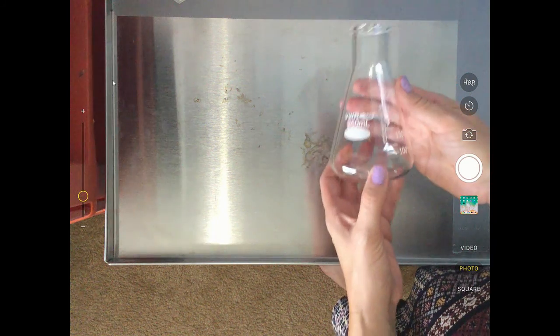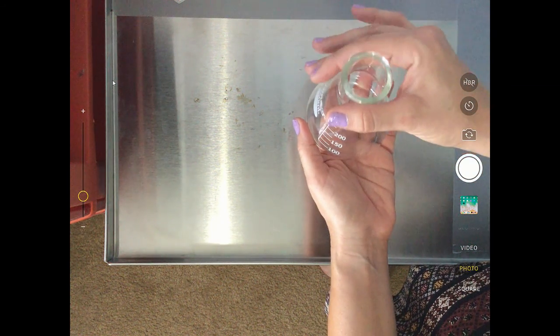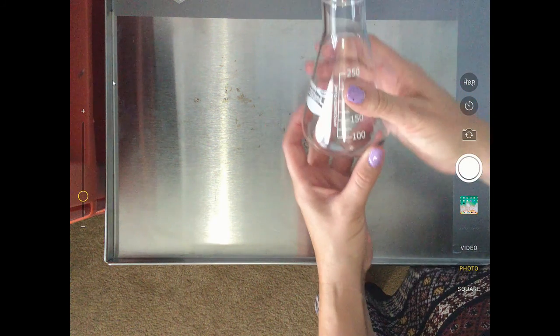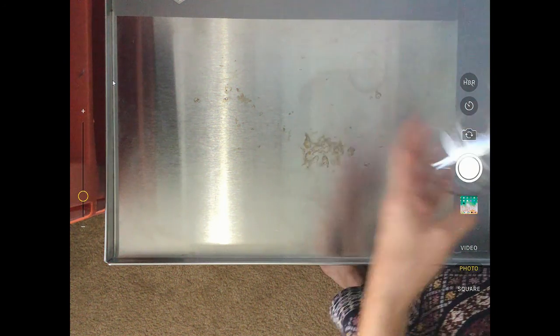A lot of times when you see mad scientist videos about Erlenmeyer flasks, people say, oh, look at what's in that beaker. This is an Erlenmeyer flask. It is shaped differently. It's got more of a triangular base, but it is also three-dimensional. It is also what we use to hold liquids, and it has also got measurements on the sides.